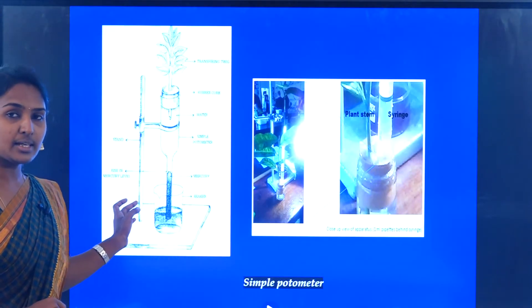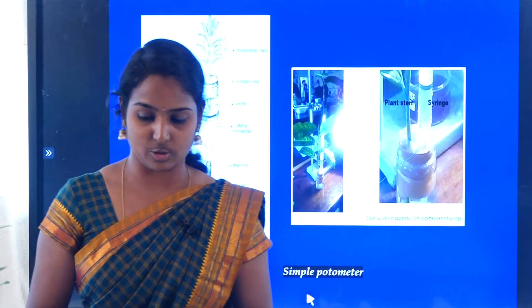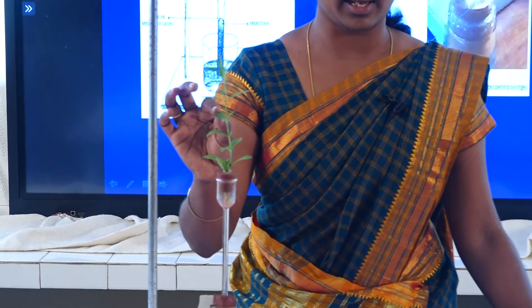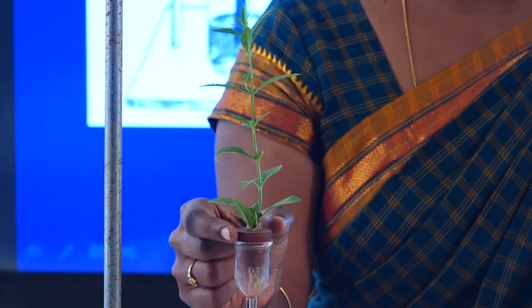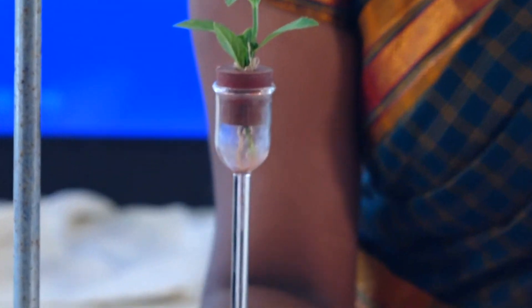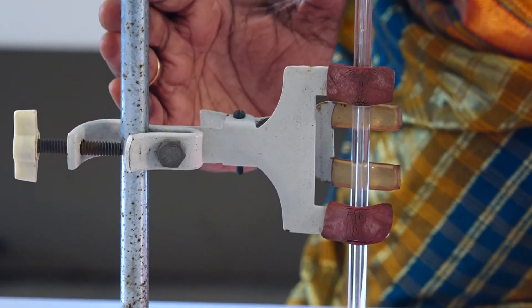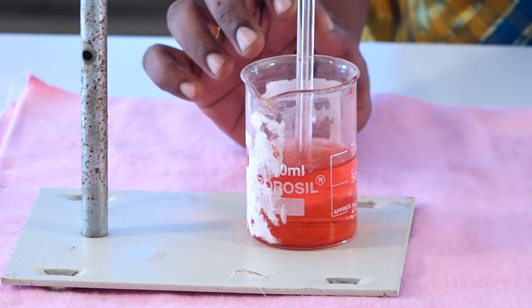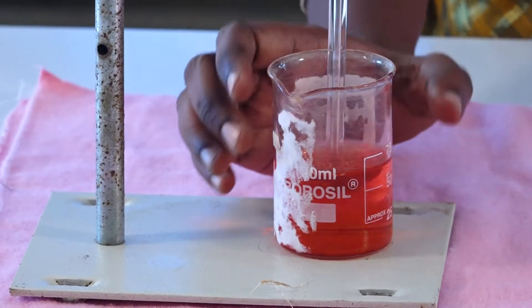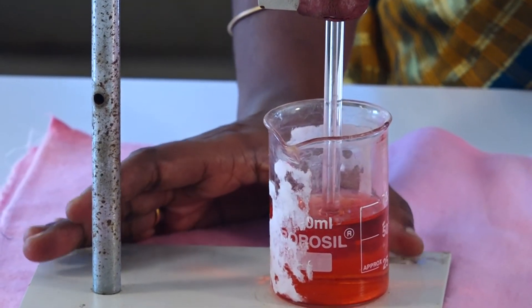This is the diagram of the experimental setup. We have one experimental setup ready — we have taken one healthy plant and inserted a pipette into it with the help of a rubber cork. The pipette is held upright using a clamp on a stand. We have taken one beaker with a colored solution prepared using saffranin dye.